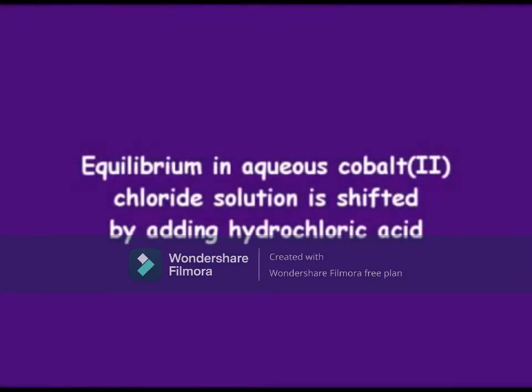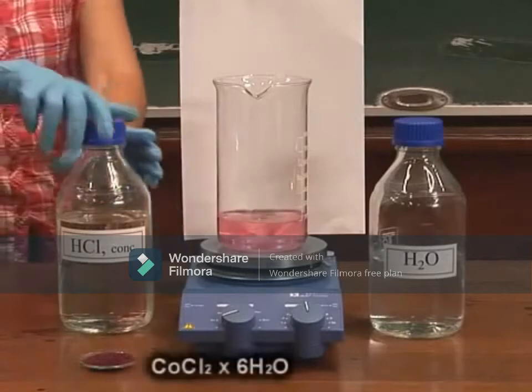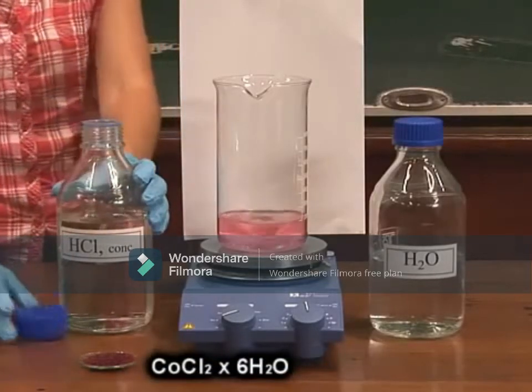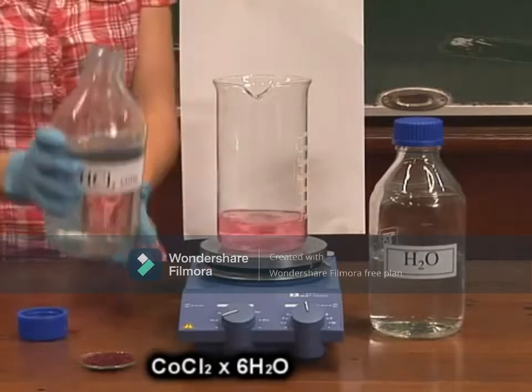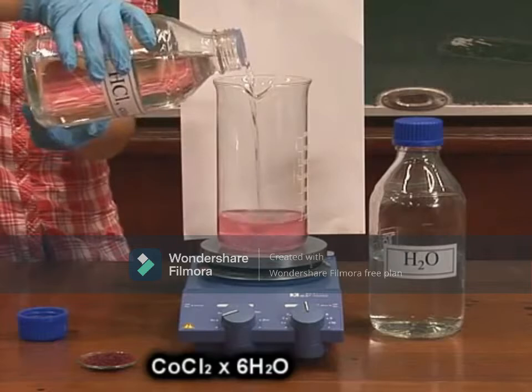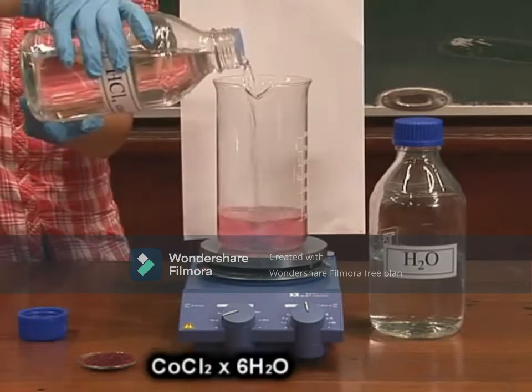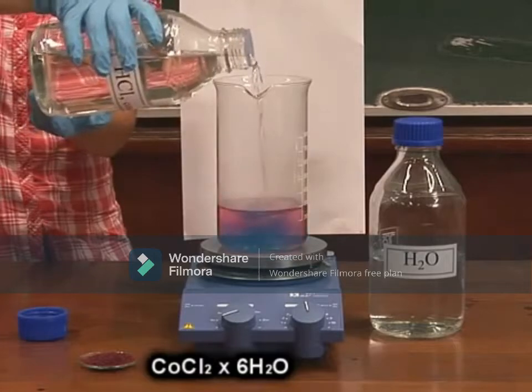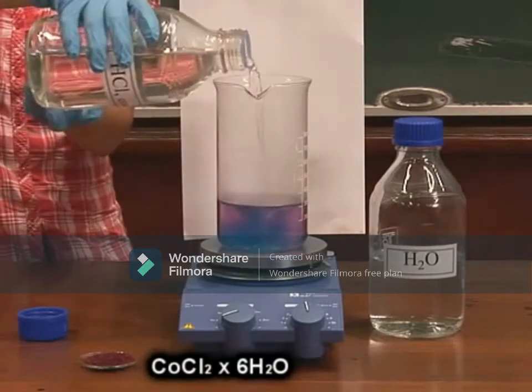The next experiment involved the reaction of cobalt chloride solution, which is a pink solution. Upon adding an acid like hydrochloric acid, there will be a change in the color observed. Look carefully. The pink solution gradually turned blue with the addition of acid.